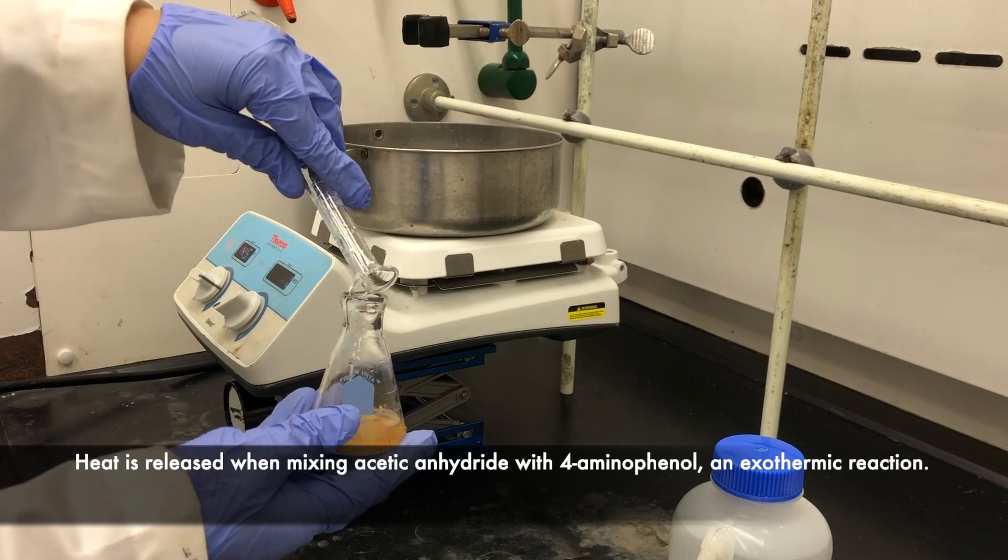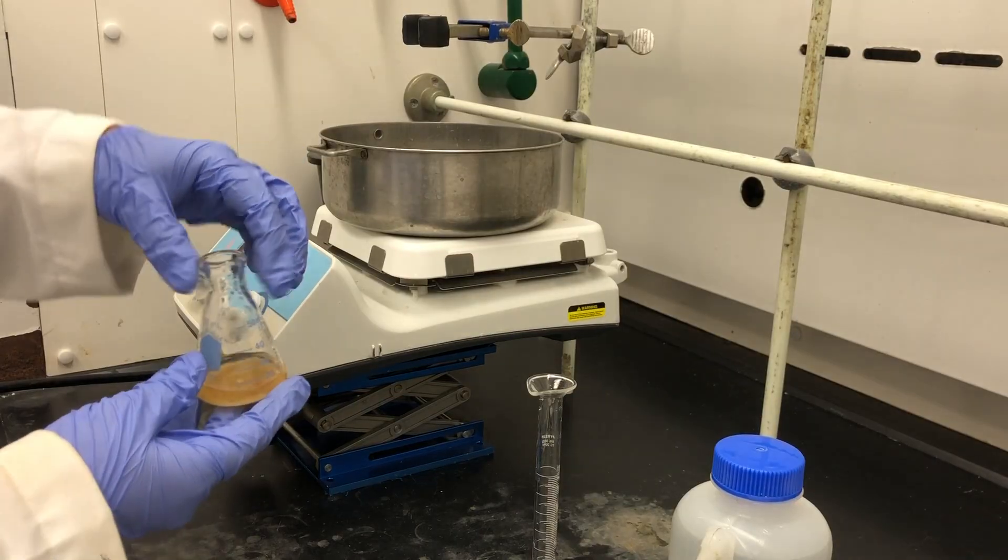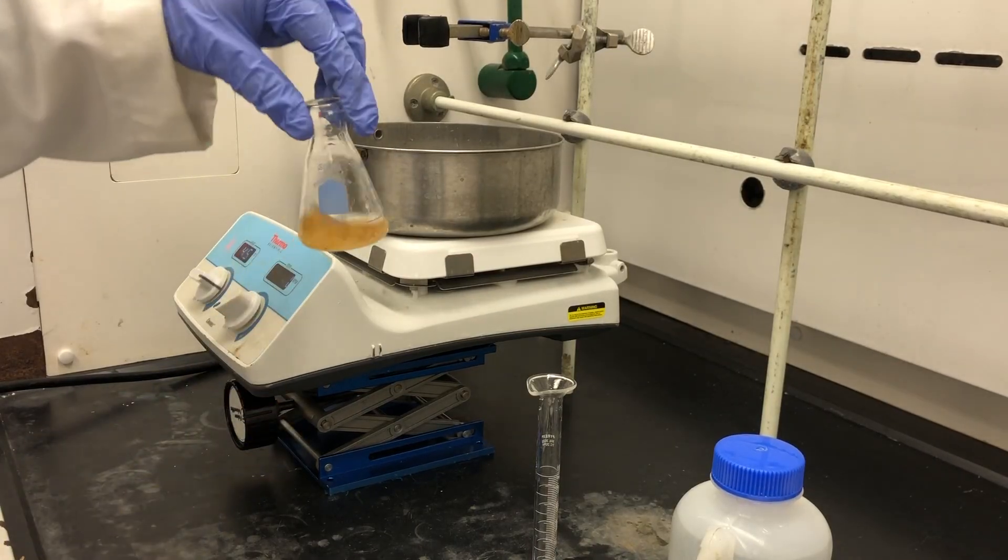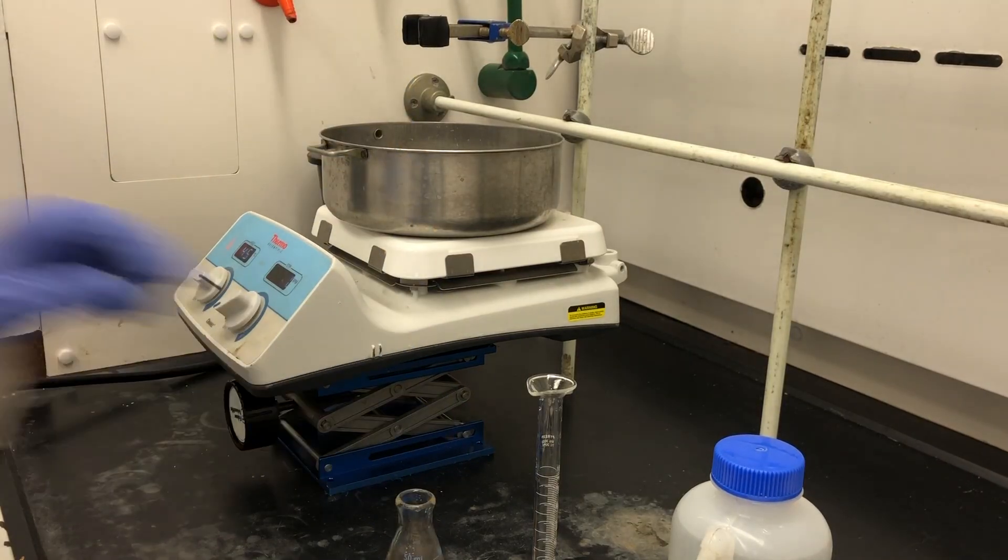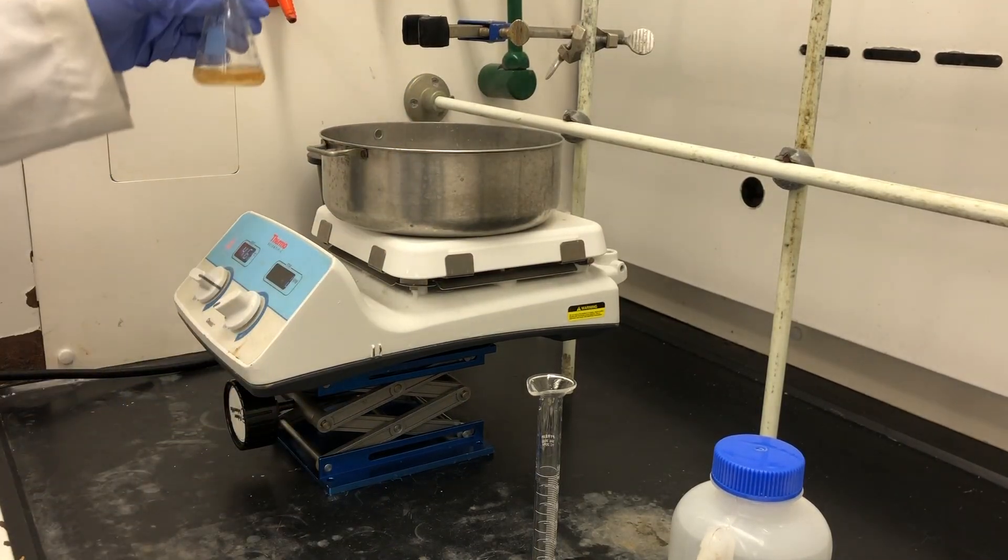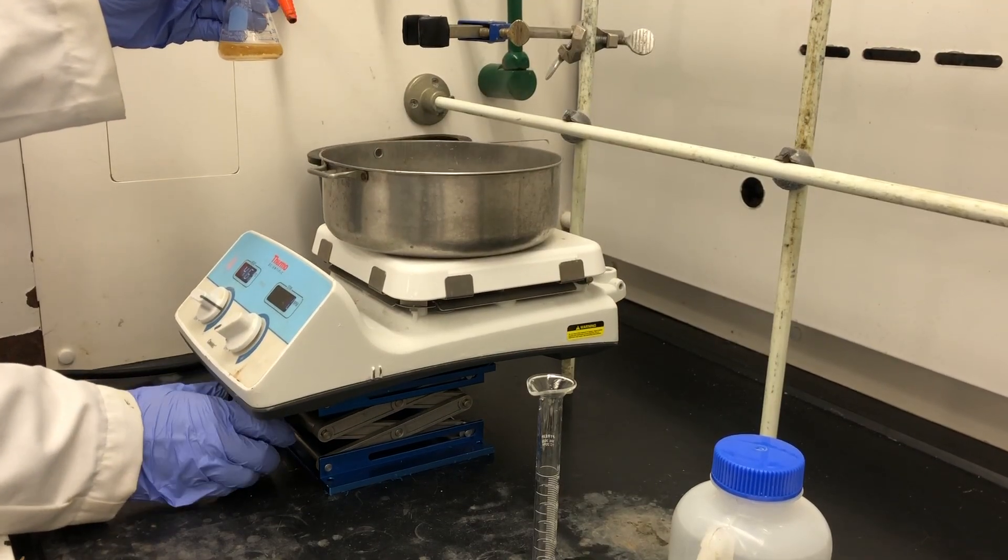Now what we'll need to do is put it in the hot water bath by clamping it on the clamp. We're going to add the stir bar to gently stir it. I can take the flask and clamp it. What you want to do at this point is definitely lower the jack so you're away from the hot water.